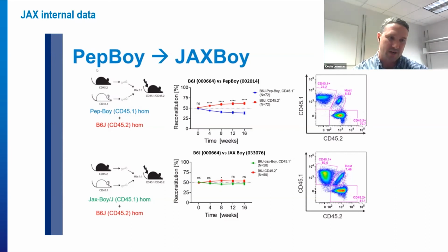But there's certainly the question of, and this is one of the caveats of how scientific research works, it's always built on the foundations of what's been proven, what's been tried before, what do we know. I can tell you we have some data that says right at the outset, I mean, there's the data that we're showing here. We've also looked at common logistical questions of breeding efficiency. Things like, can you use the same reagents, the same husbandry? It's the same background strain, of course, but perhaps a little bit more of that background strain.